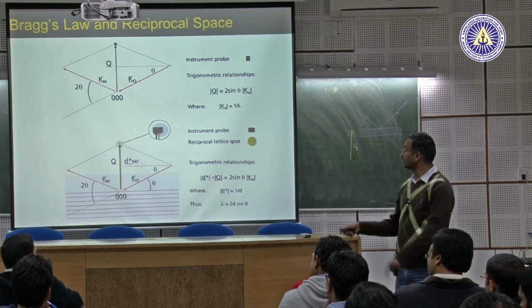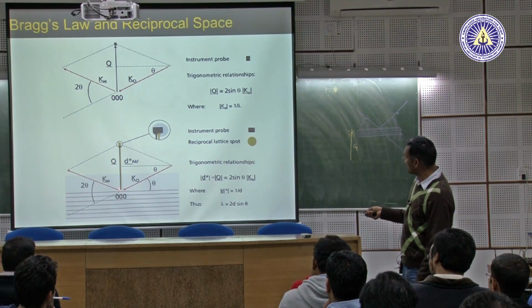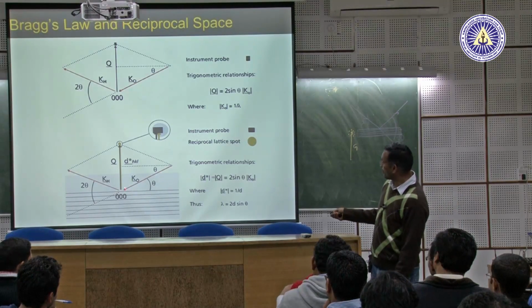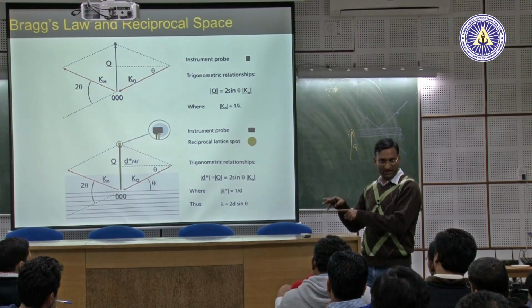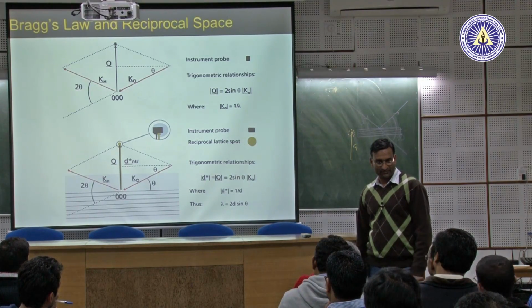With respect to the sample. So, what you do is you fix the origin and you change these points. You take care of differences in these points and this point. So, all the misalignment here is translated into the misalignment at that point.